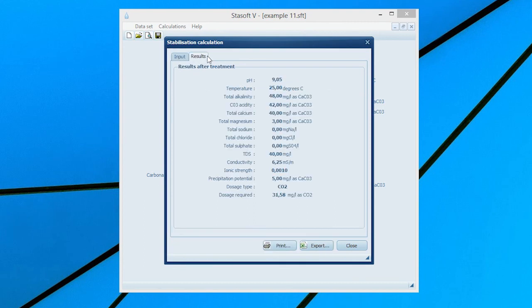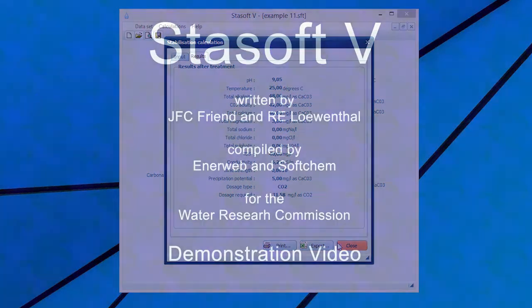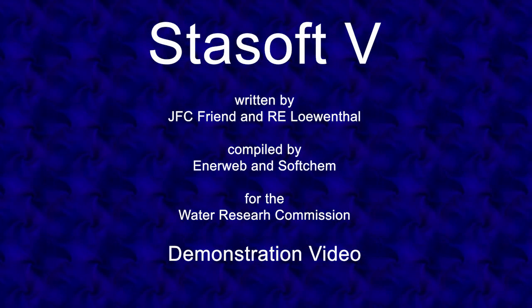Selection of the Results menu option will bring the Results After Treatment window onto the screen with values for the final state of the water and for the dosage of carbon dioxide required to adjust the water to the specified calcium carbonate precipitation potential. More details on the use of this program are available in the StaySoft 5 manual.